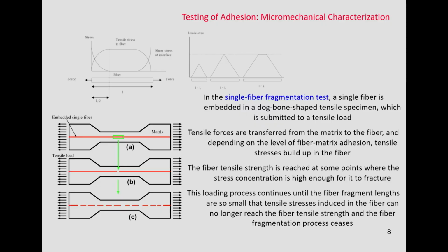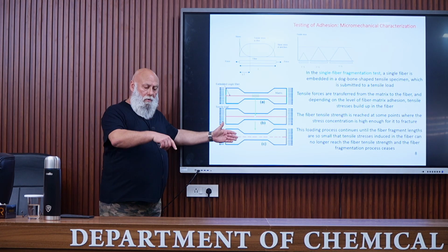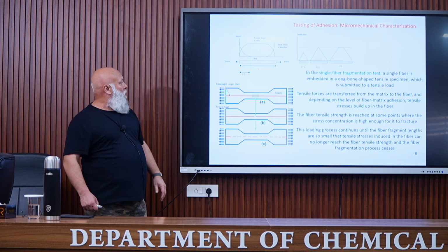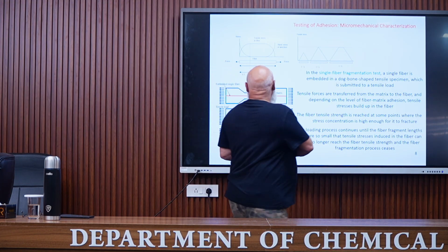When using a transparent polymer matrix, an amorphous polymer, it's quite easy. But when it's an opaque polymer, it's necessary to polish the sample until reaching the fiber. Okay? The reason for this is reported here.